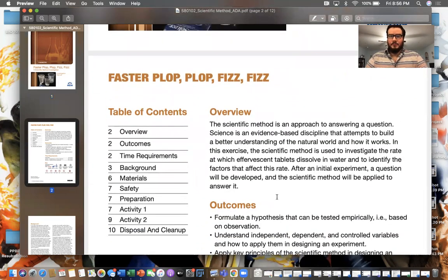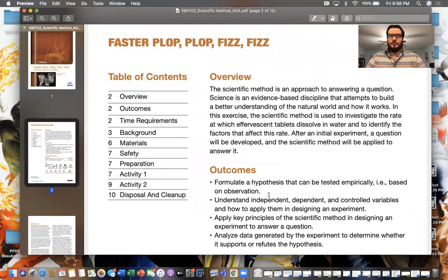I'll go through it as an overview, but feel free to stop and start this video as you see fit to read along. So the overview of this lab is pretty straightforward. The scientific method is an approach to answering a question. Science is an evidence-based discipline that attempts to build a better understanding of the natural world and how it works. And so in this exercise, we're going to be using the scientific method to investigate the rate at which Alka-Seltzer tablets dissolve in water, and to identify the factors that affect this rate.